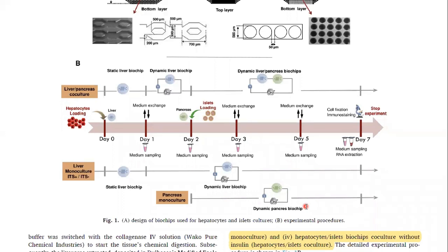For the pancreatic islets culture in the biochip observed here, the biochips were previously filled with culture media in order to remove the air bubbles and moisturize the circuits. Preconditioning was carried out for 1 hour at 37 degrees Celsius in the incubator. Pancreatic islets in the preservation solution were washed with cold culture media and gently diluted.